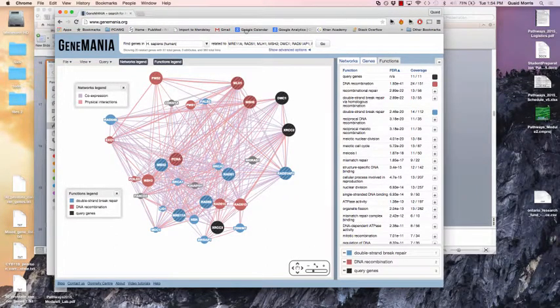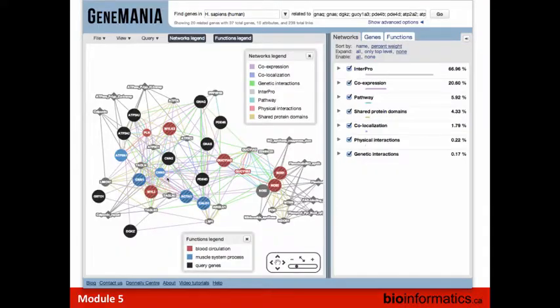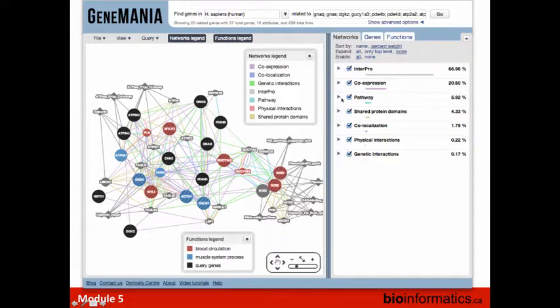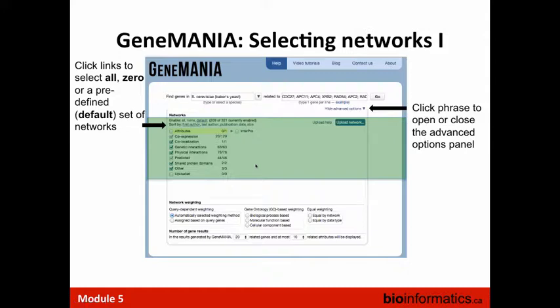So that shows you where the weights come from. Here is the gene list from the previous slide, and these are the weights assigned to all the various different sources of information on this gene list. The black nodes or nodes colored with bars through them are ones from the original list, and everything else are recommended or related genes that GeneMANIA has found.